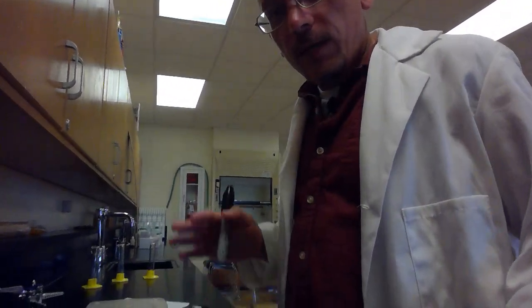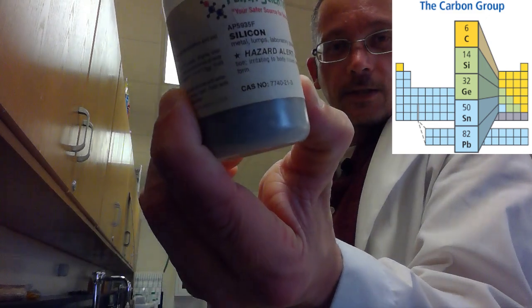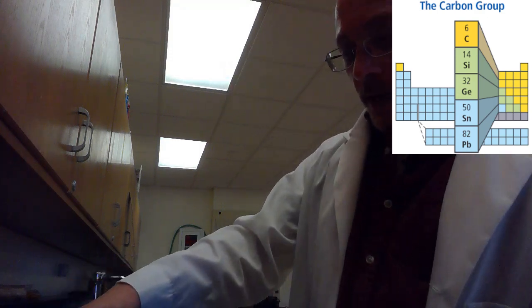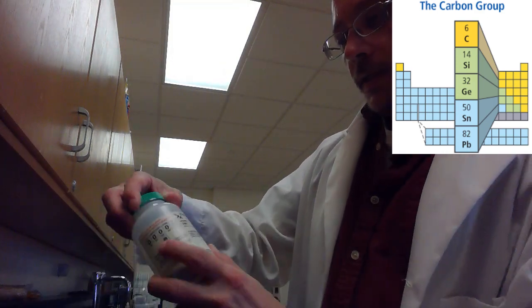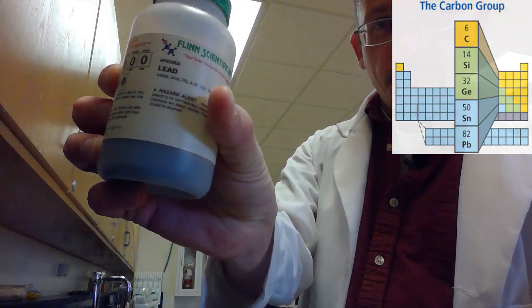And now we're going to do kind of the same thing with the next row over. I have here the next row over there, you know, it starts with carbon. And then below carbon, you've got silicon. Below silicon, you've got germanium. And we're going to try to find the density of germanium. Below germanium, you've got tin and lead. So what I'm going to do is find the densities of these. I'm going to make a little graph. And then we're going to predict the density of germanium. And then we'll go ahead and look it up and see what it actually is.